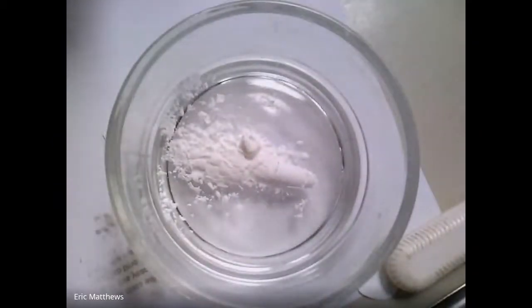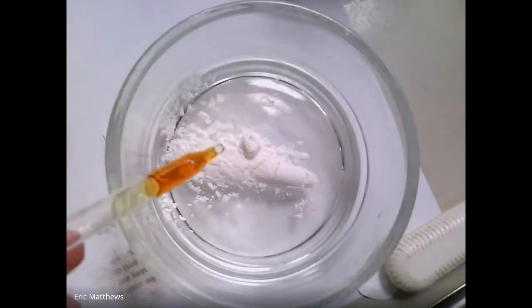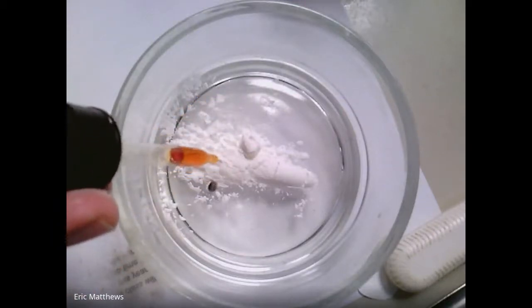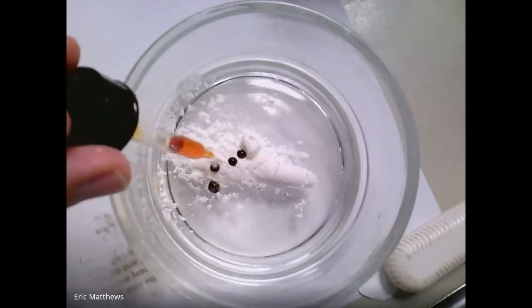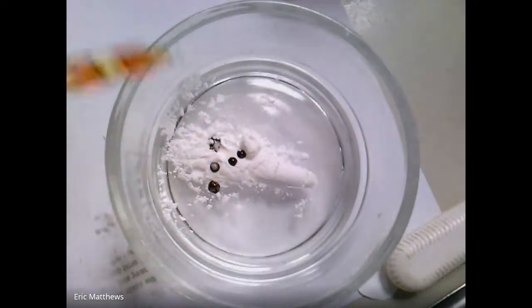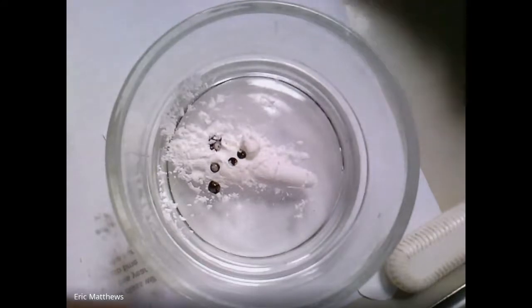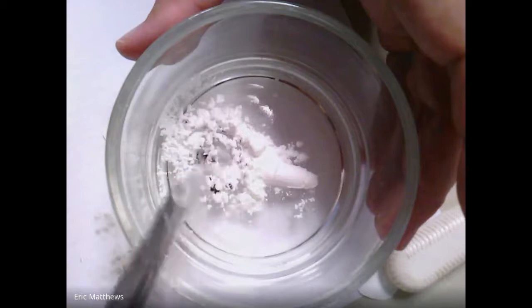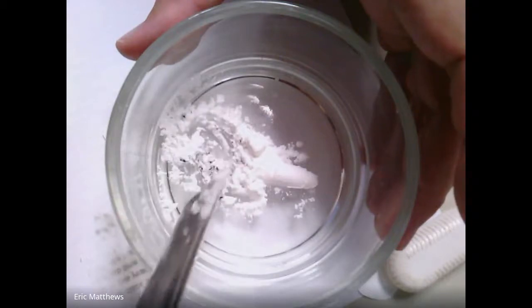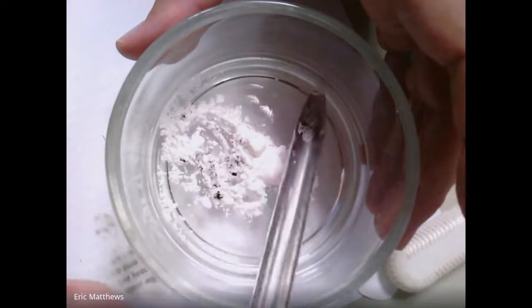Zoop. Right. Now, normally, once again, iodine is this nice golden brown color, but watch what happens when it mixes with starch. What color does it turn? Black. This is what happens when iodine mixes with starch. It is what we call an indicator, and there's a color change as it mixes with the starch, and it turns black, like you see there.